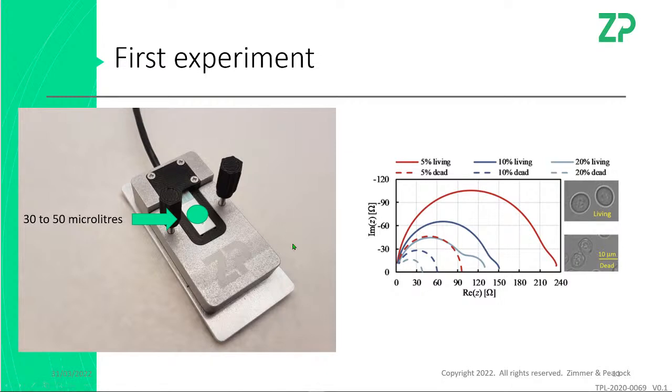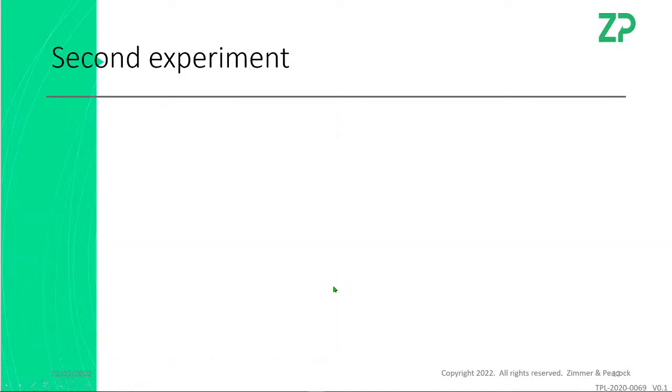Take a drop of the cells, measure the impedance spectrum, let's say, of those cells. If you can induce a death of those cells in situ, even greater, but otherwise, try the same experiment with essentially the same population of cells, but now dead.